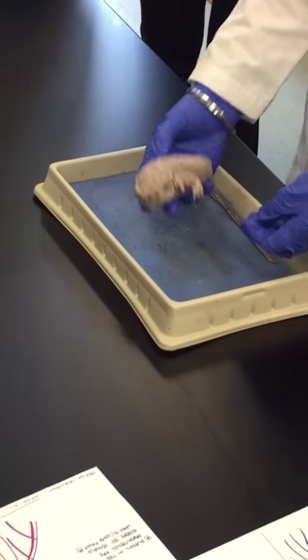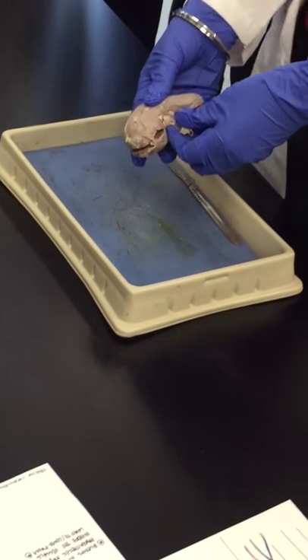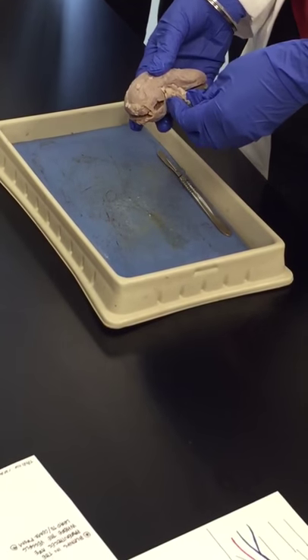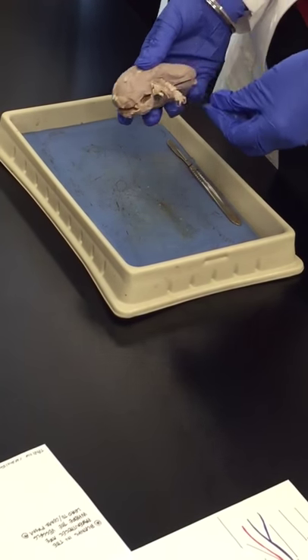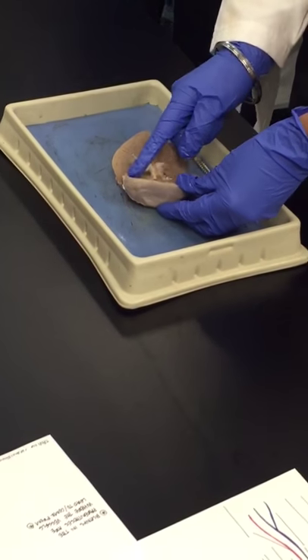This is a kidney. This is the hilum where we have the renal artery, the renal vein, and the ureter coming out.